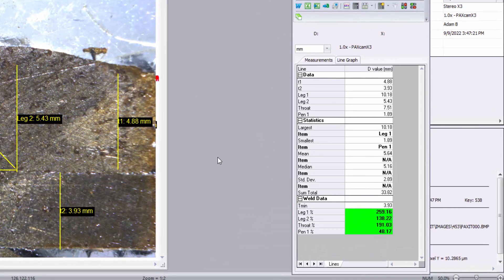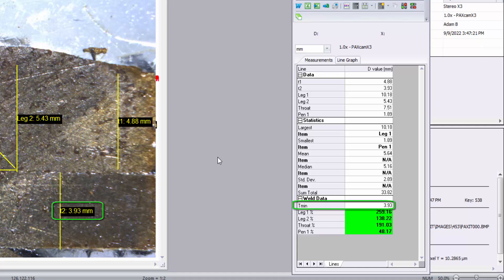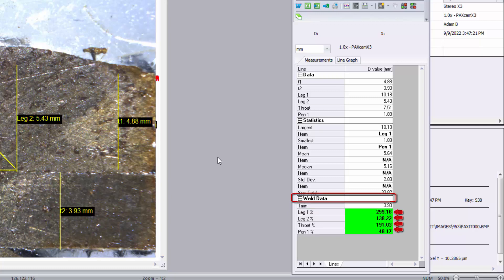Calculations and tolerances may be configured to display real-time pass-fail results in the measurement totals window. By designating a common line title for material thickness measurements — in this example, all lines named T — Paxit identifies the lowest value as Tmin, a common denominator used by most weld specifications to determine passing or failing measurements. The weld data section displays each measurement's ratio to Tmin as a percentage, which can then be assigned pass, fail, and borderline tolerances using Paxit's tolerance spec feature.